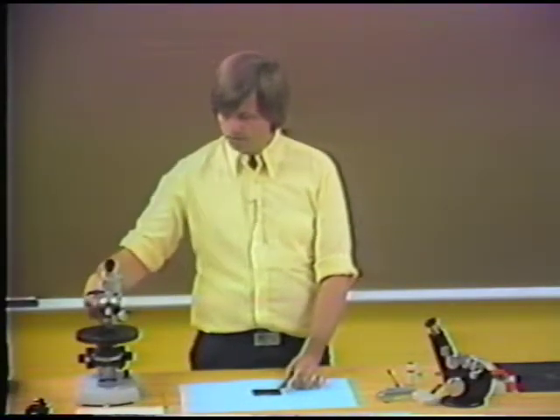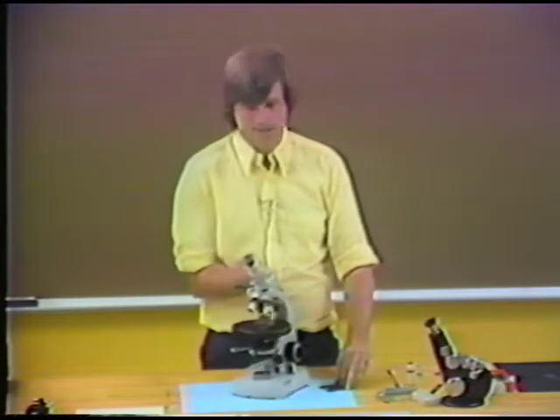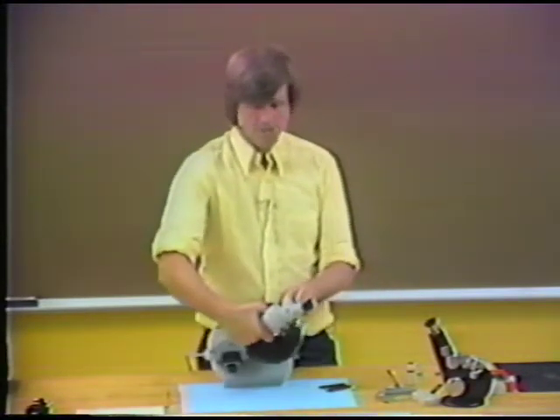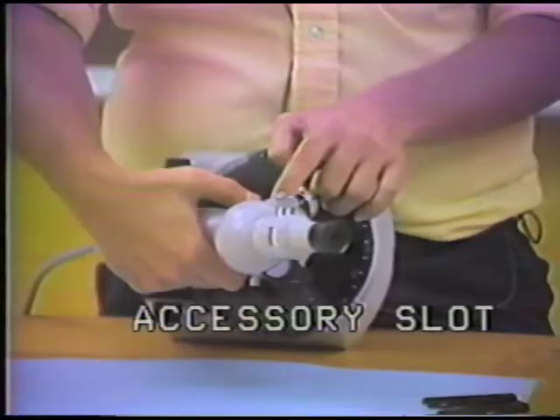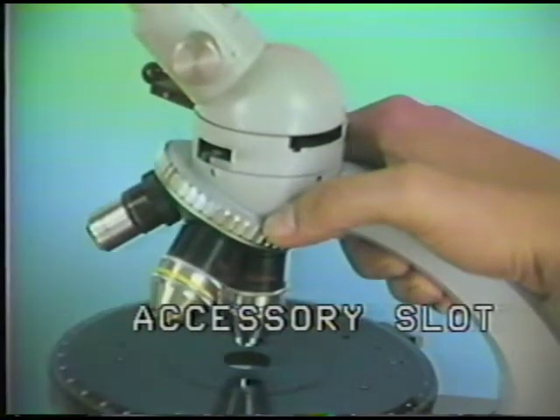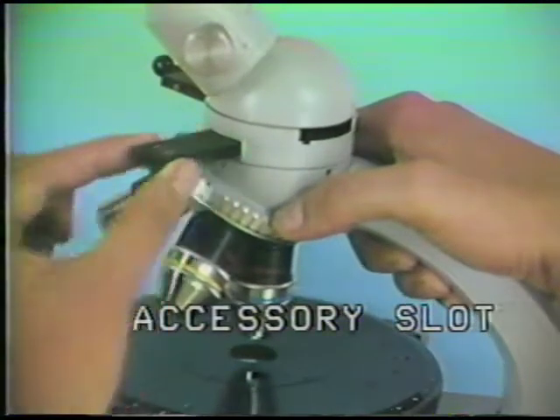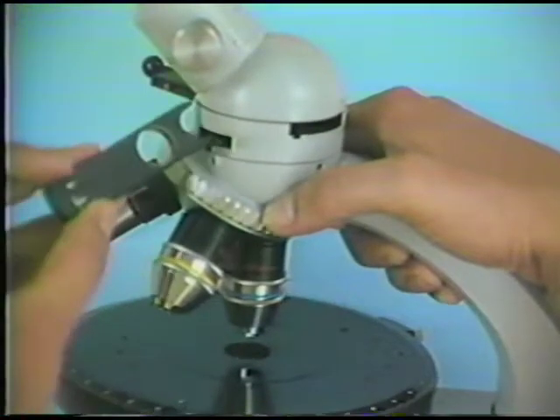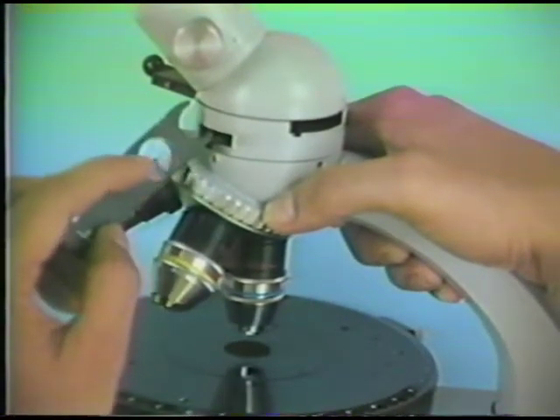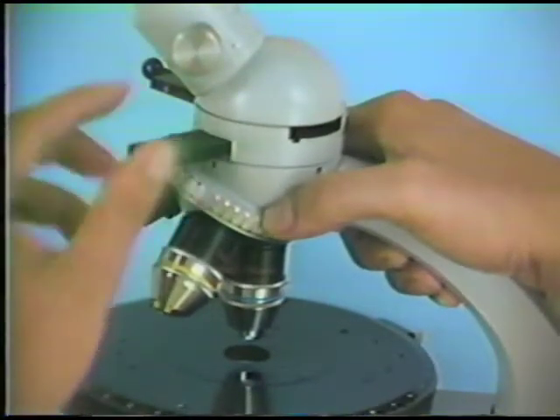In order to see what we do, I'll put the microscope back up here and show you an accessory slot, which is located right here in this position of the microscope. And the accessory slot being located right here, you can slide the accessory plate right into the accessory slot and to the position above the stage, so that the mineral that's found there actually intersects the light source of the microscope.